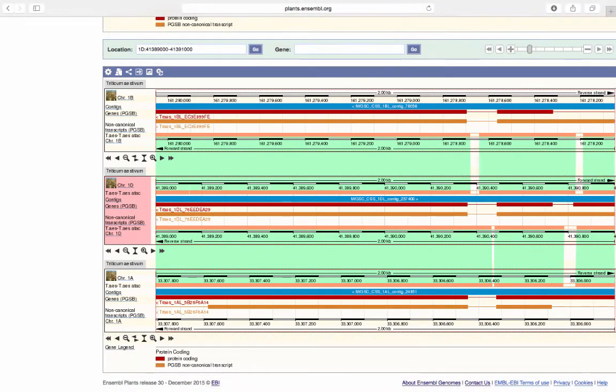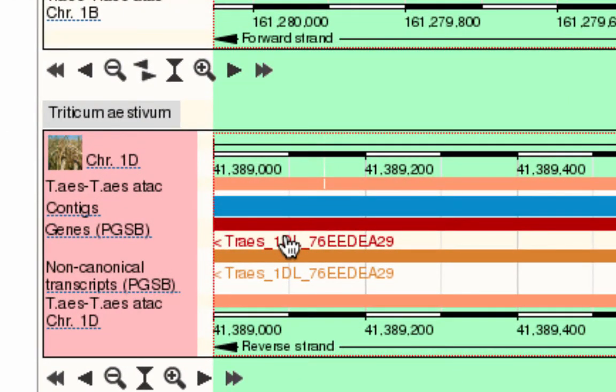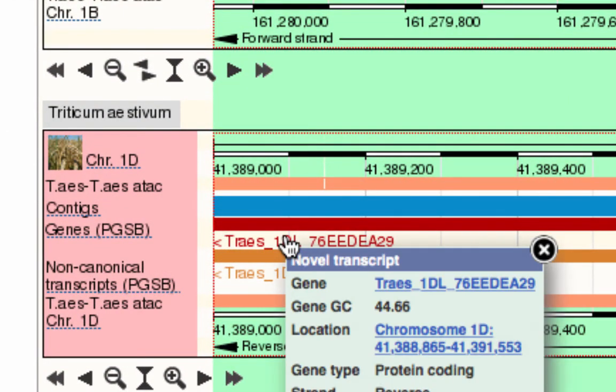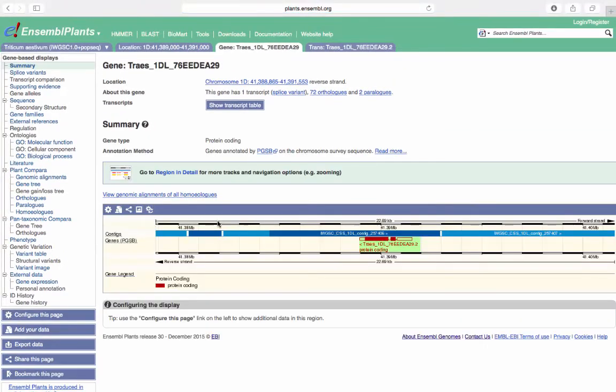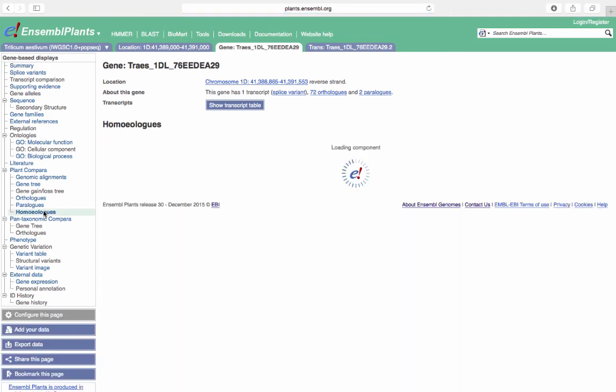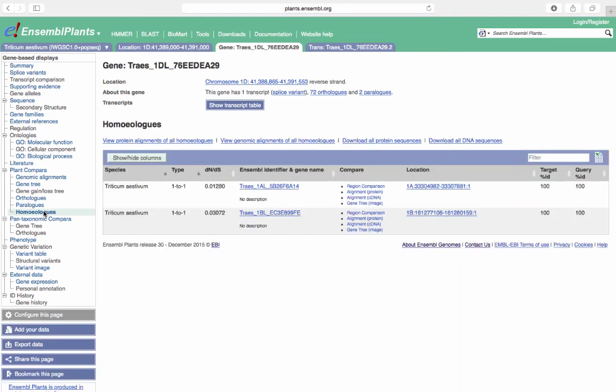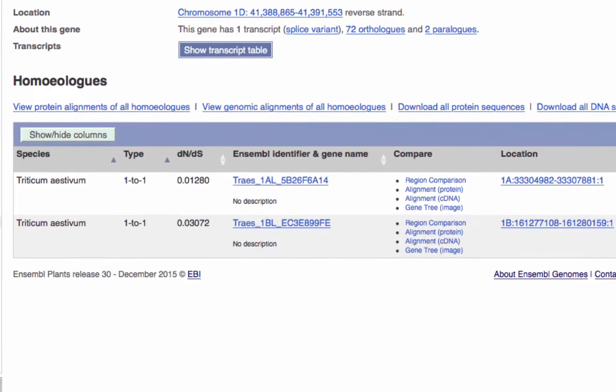You can also find the homeologs for individual genes from the Gene tab. Click on Traes underscore 1DL underscore 76EEDEA29 to take us to the relevant Gene tab. Then select Homeologs from the menu on the left-hand side. Homeologs genes were formed by a speciation event followed by a hybridization event. In this table, you can view the homeologs and their genomic location, as well as links to region comparisons and alignments.